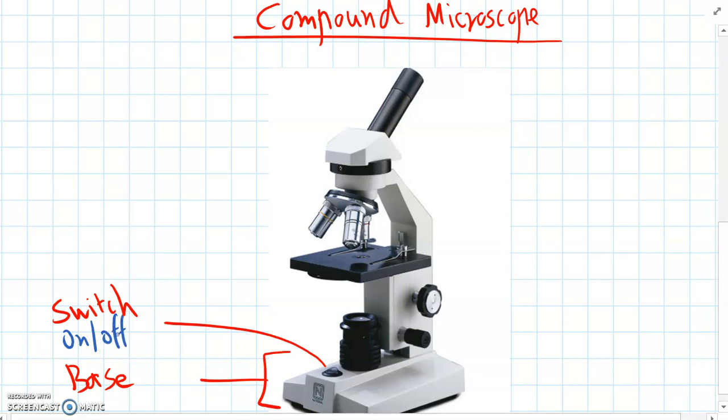Because we need to plug these into power to run the lamp. And then we've also got the light source itself which is in this black section here.